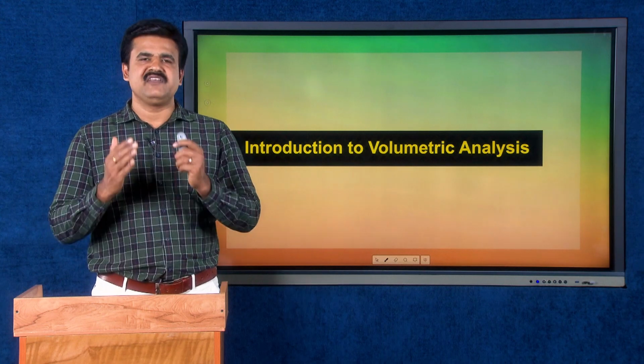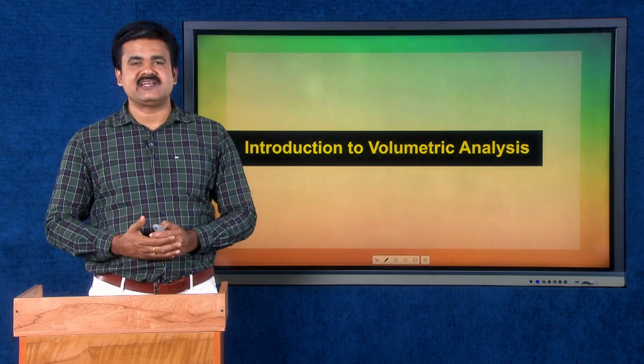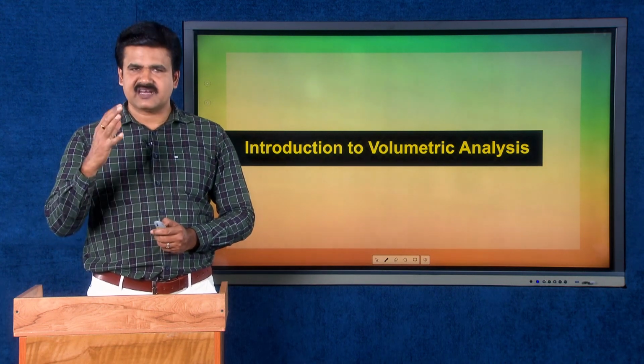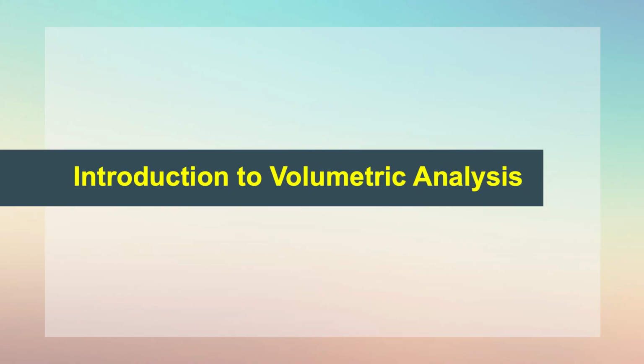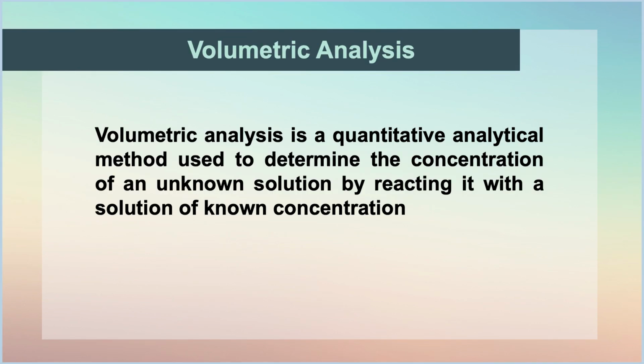Now, we are entering into volumetric analysis. That is, we are now having an introduction to volumetric analysis. Our title is Introduction to Volumetric Analysis. Volumetric analysis is a quantitative analytical method used to determine the concentration of an unknown solution by reacting it with a solution of known concentration.